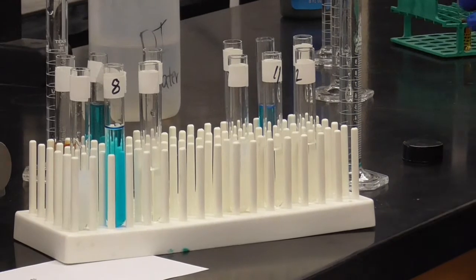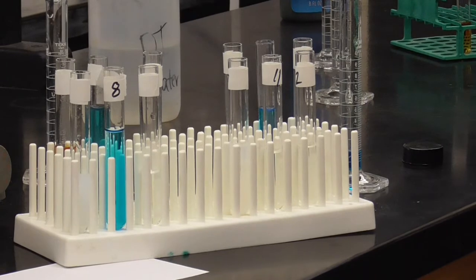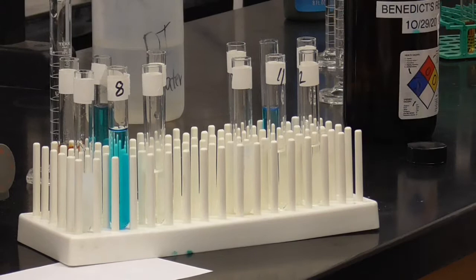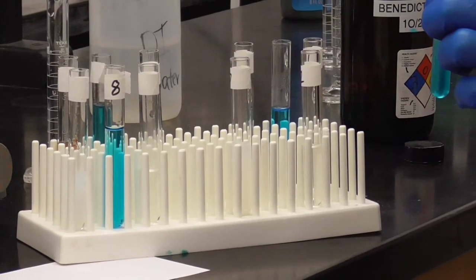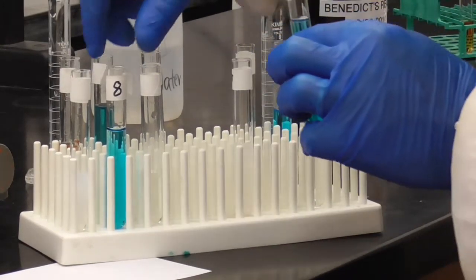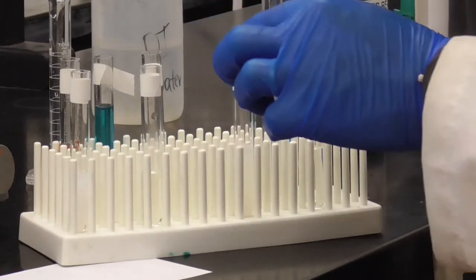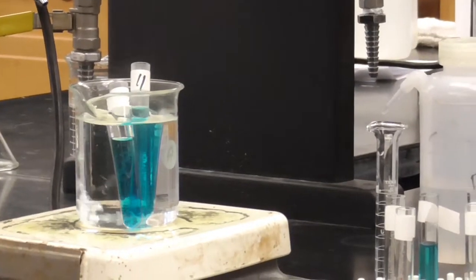And then another 3 for the other test tube. Test tube 11. So as usual, we need to heat that up. So test tube 8 goes in there, and test tube 11. And we give that 3 to 5 minutes. So while those are heating, let's go ahead and do our starch test.